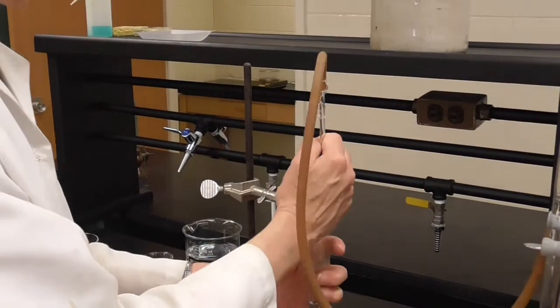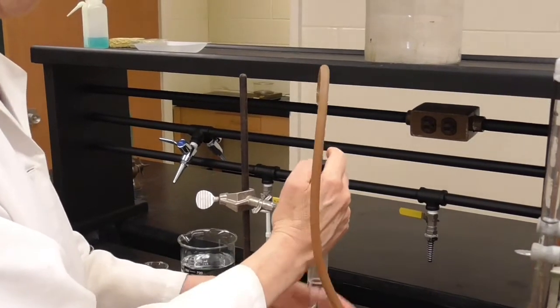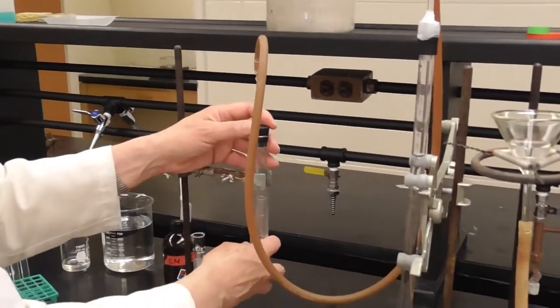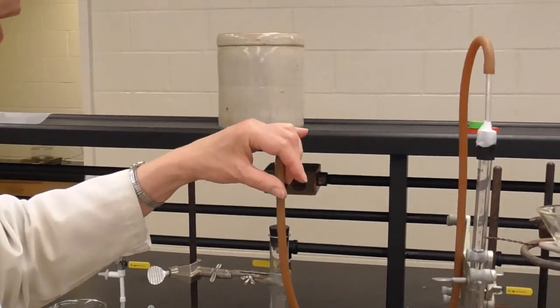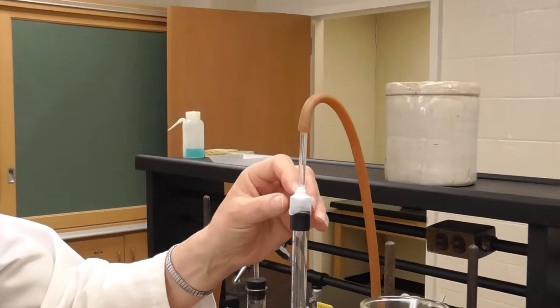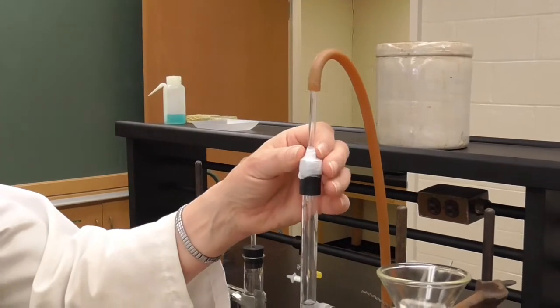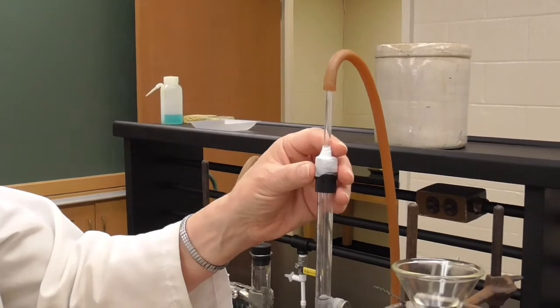So now we can focus on the apparatus that has already been set up. You can see that we've got a 1-hole stopper connected with glass tubing to amber tubing, and that is then connected over to the top of a burette. I've already sealed off with parafilm the top of this connection because that is a typical place where gas can leak out.